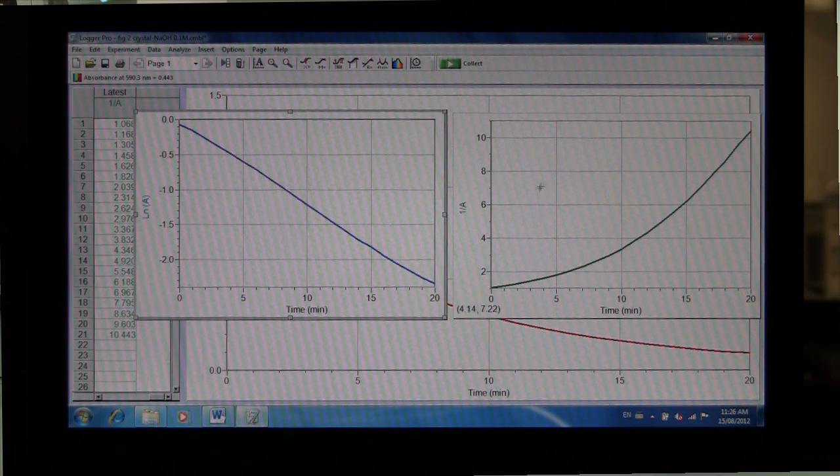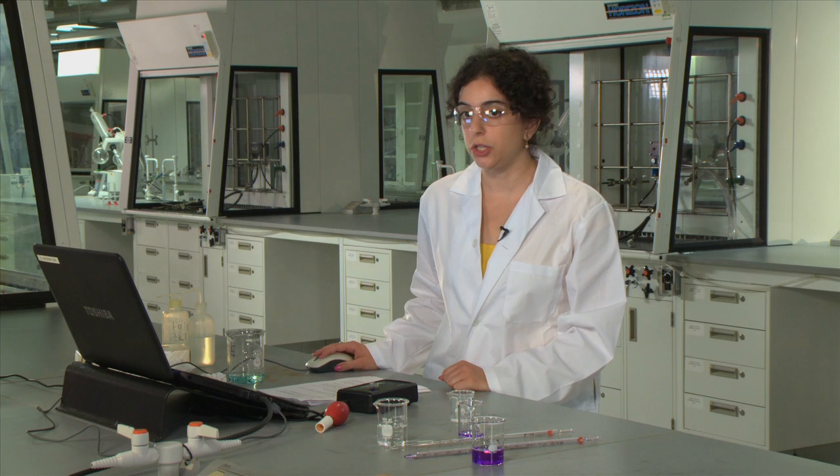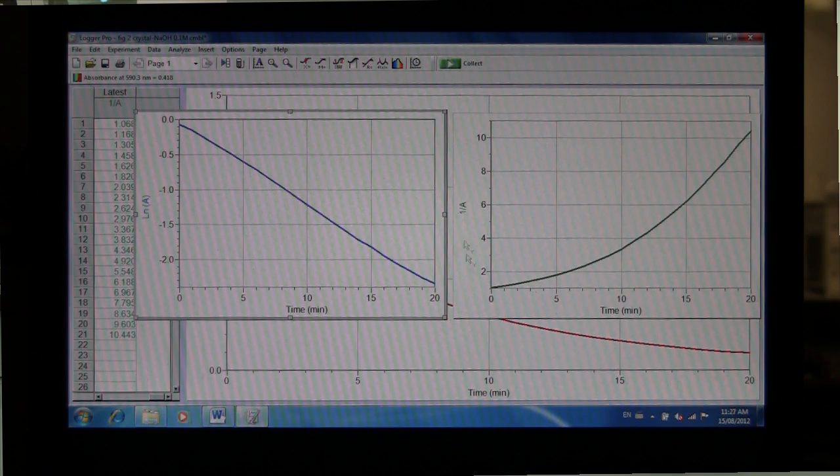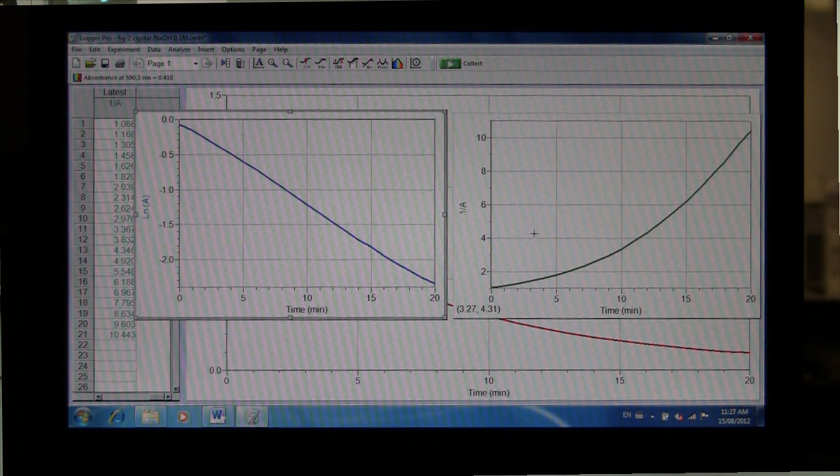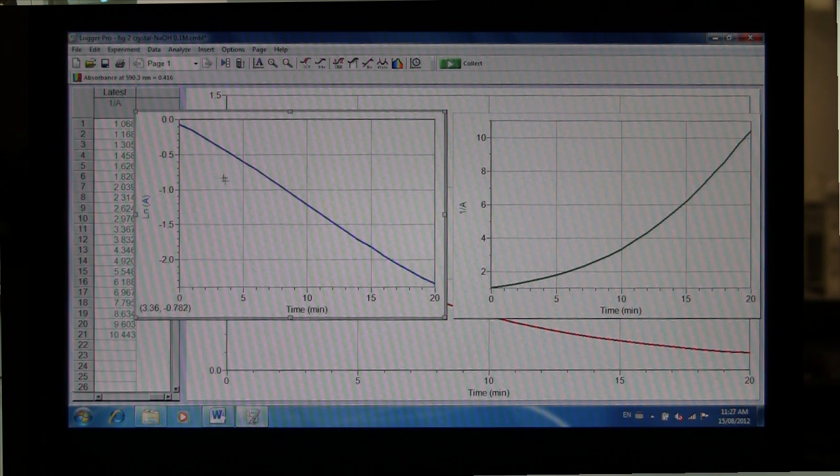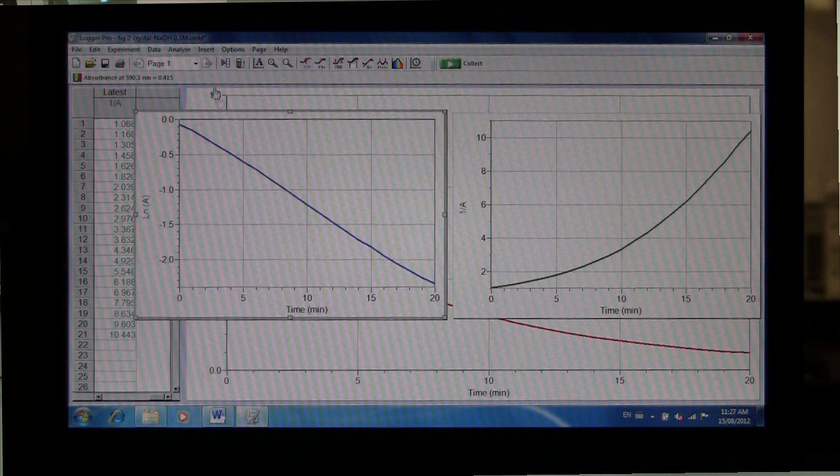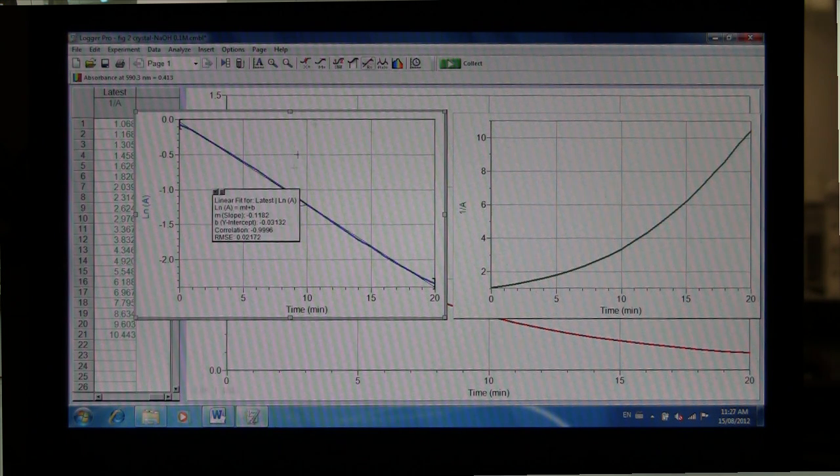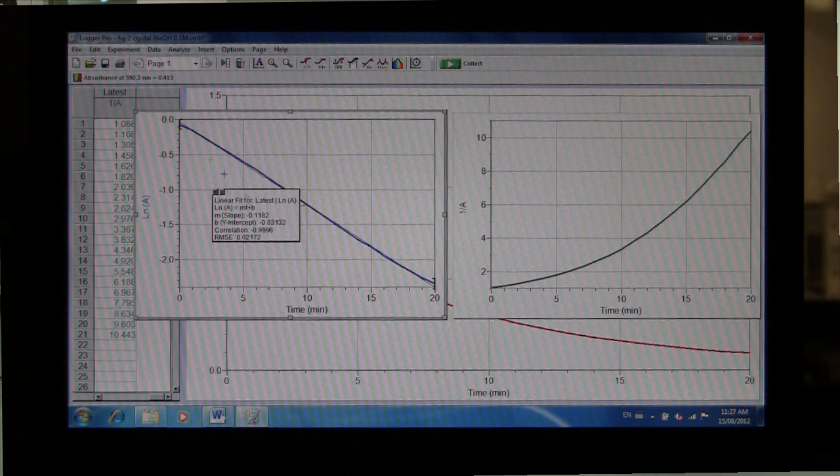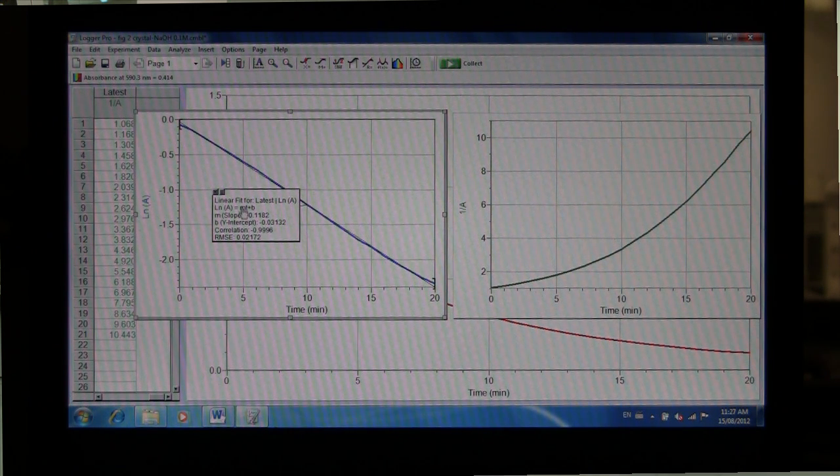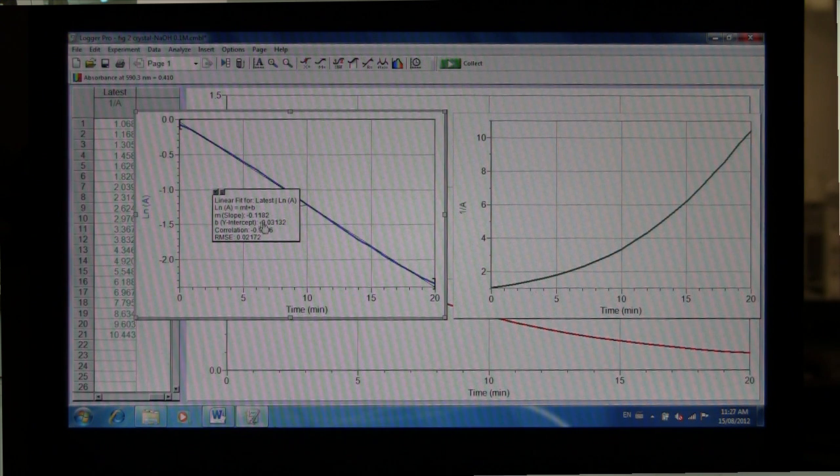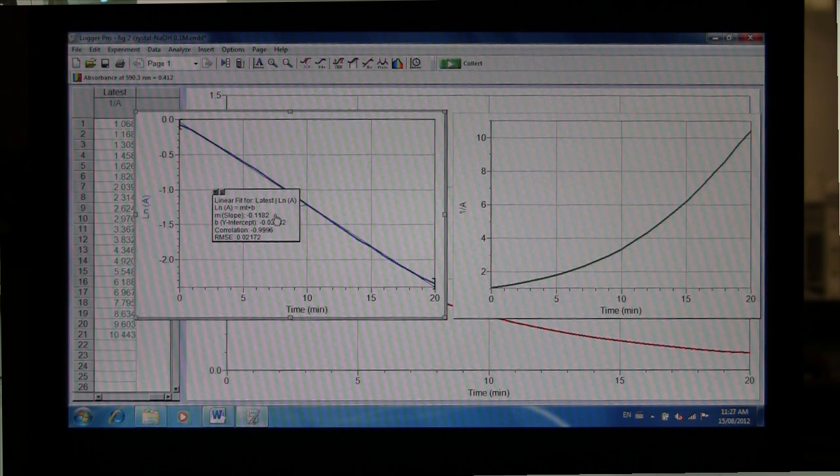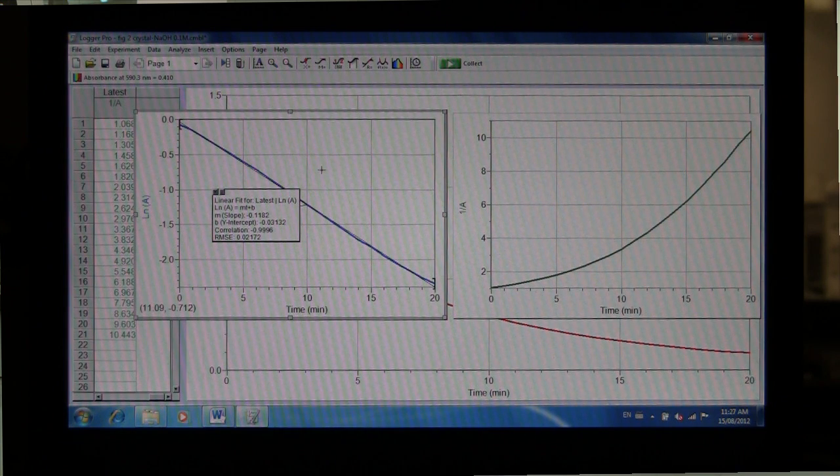So with these two plots, you'll be able to determine the reaction order. The key plot to look at is your natural log plot. If it is linear, and your 1 over absorbance is non-linear, then you know your reaction is first order. We can get some further information from our log plot by clicking on it to make it active, and then select Linear Fit. And it will give us the equation of that line along with the variables, so slope and y-intercept, and so on. This will allow you to obtain information about your rate constants.